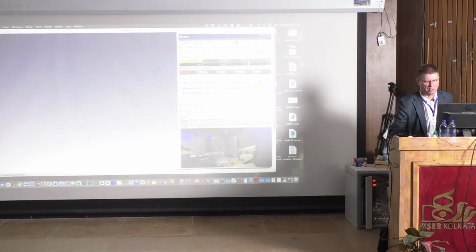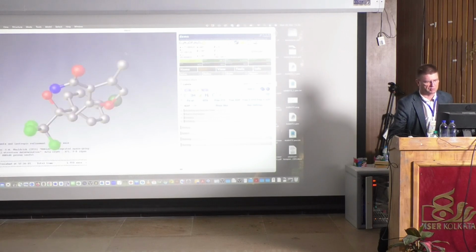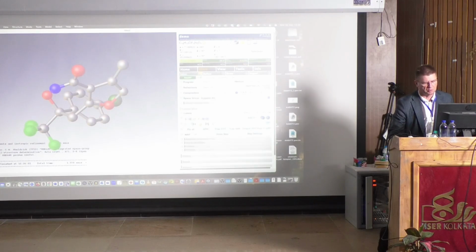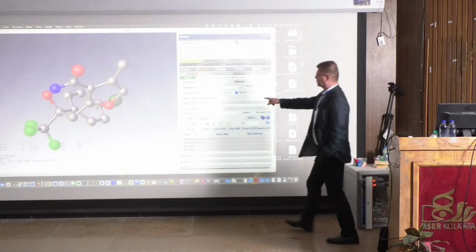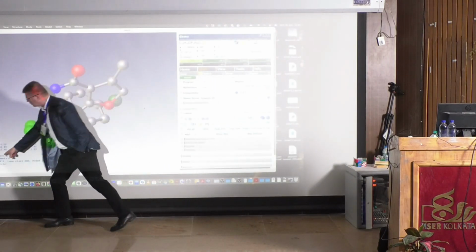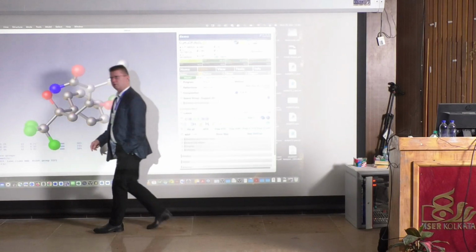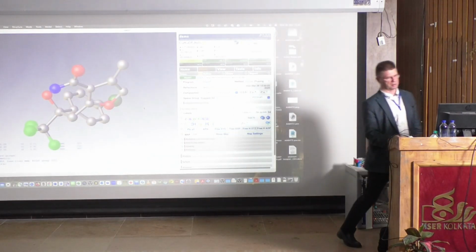So I will go now to the work, and now in the work here I will click. I'm sorry, no, it went incorrect. Sorry, I was too fast because my idea was to show you this now. So I was clicking the space group. In there it lists the space group, which is the symmetry operations. Okay, then it was too fast. I will do it again.